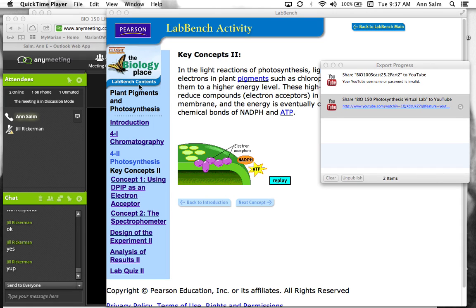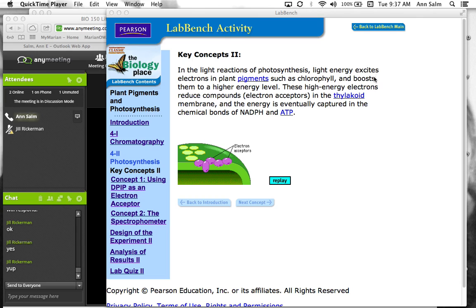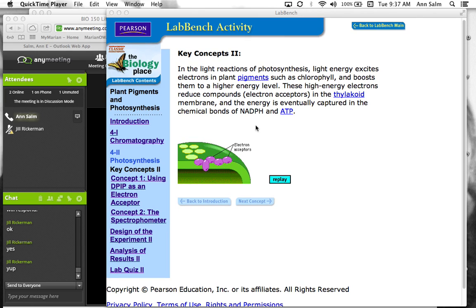Okay, Life Systems Labbies, this is the Photosynthesis Lab Part 2. I've got the screencast on the sidebar here, or I'm sorry, the net meeting menu on the sidebar here, so just bear with me if I have to answer some of the questions here on the side.